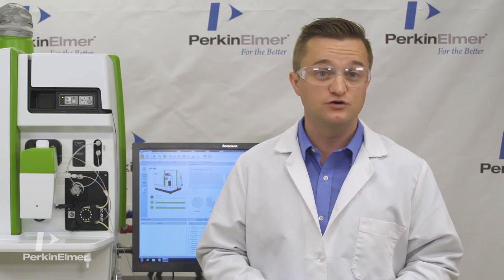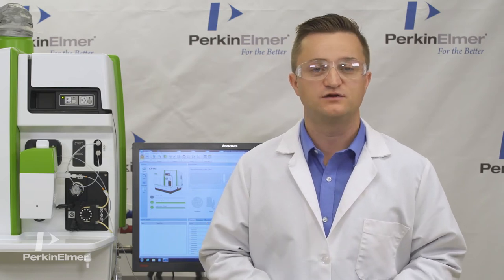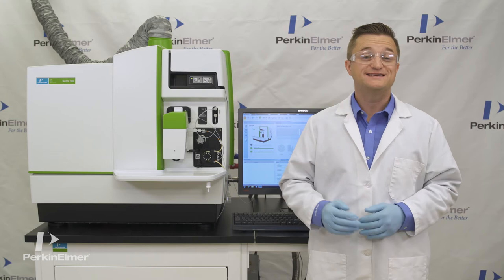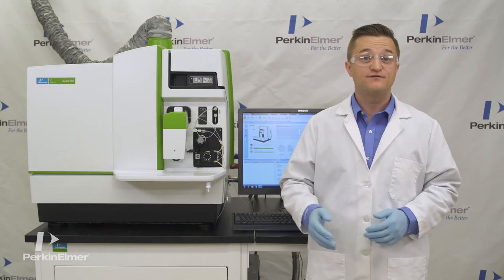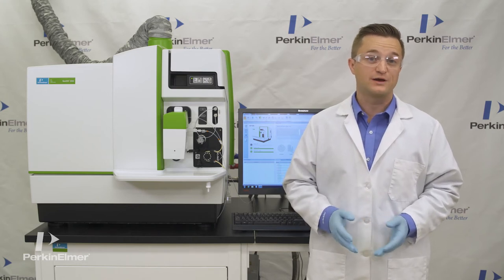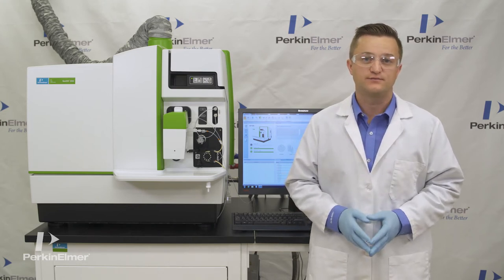The efficient plasma coupling is effected through PerkinElmer's revolutionary luma coil technology. This all-new load coil design is guaranteed for the life of the instrument and requires no water or gas to cool it.